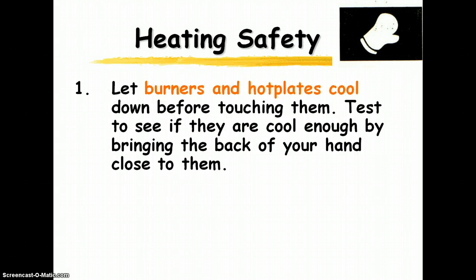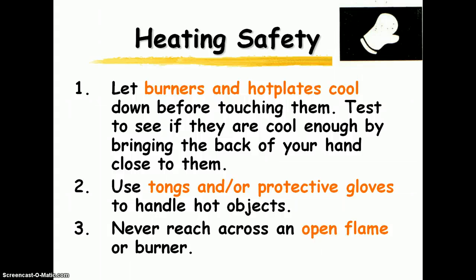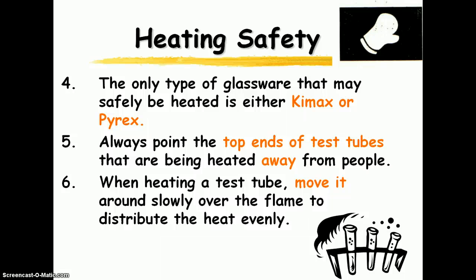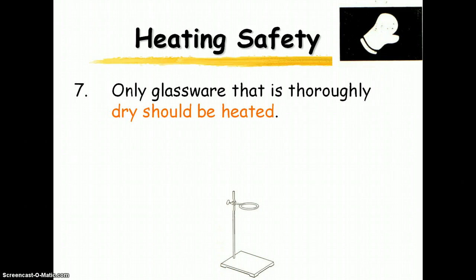For heating safety: make sure burners and hot plates are cool before touching them. When handling hot objects, use tongs or protective gloves that we will have in class. Never reach across an open flame or a burner. When heating test tubes, make sure the open end is pointed away from people — if something splatters out, we don't want it on someone. Move the test tube slowly to distribute the heat evenly. Glassware should be thoroughly dry before being heated; otherwise there's a good chance it could break.